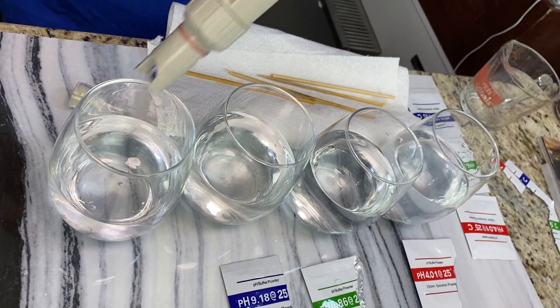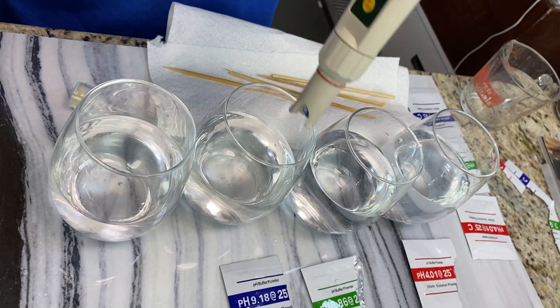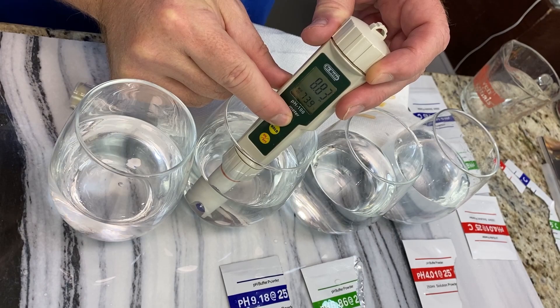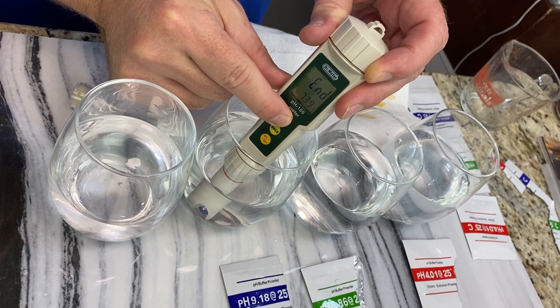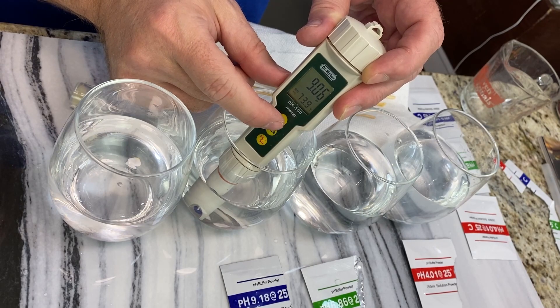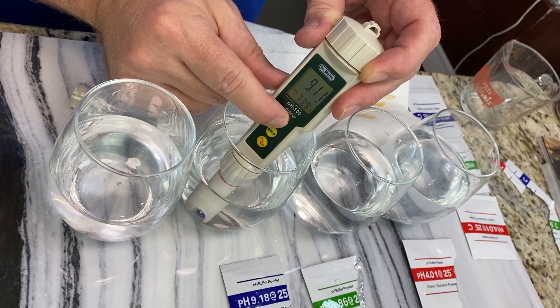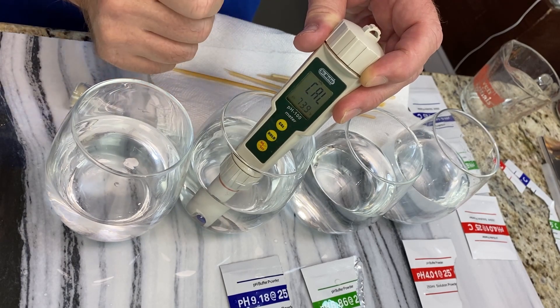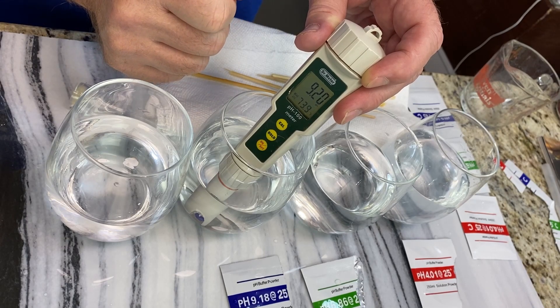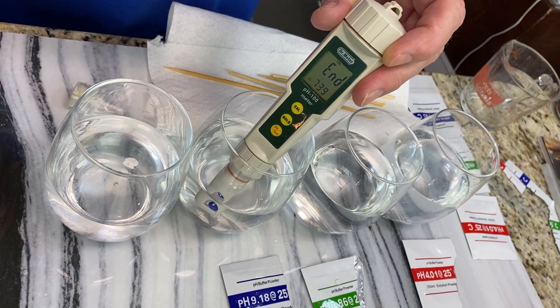Take it out, put it in fresh distilled water to rinse, then put it in the 9.18 solution. Hold calibrate for three seconds. I had to do it twice — the first time it just said 'end' and I missed the calibrate display. The second time I saw 'Cal' and it read 9.20. It's close enough. Saved and done.